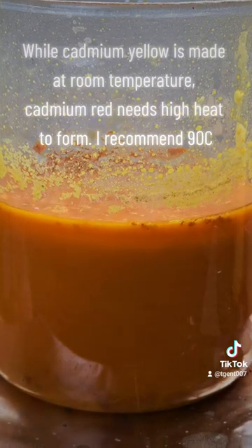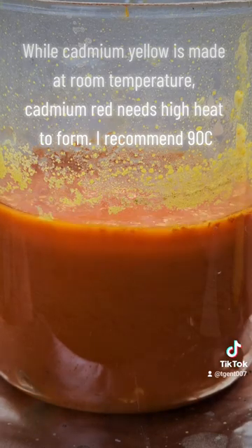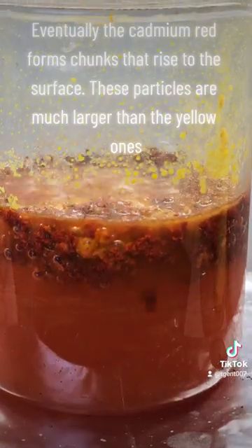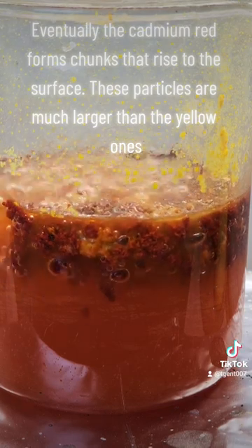While cadmium yellow is made at room temperature, cadmium red needs high heat to form — I recommend 90°C. Eventually, the cadmium red forms chunks that rise to the surface. These particles are much larger than the yellow ones.